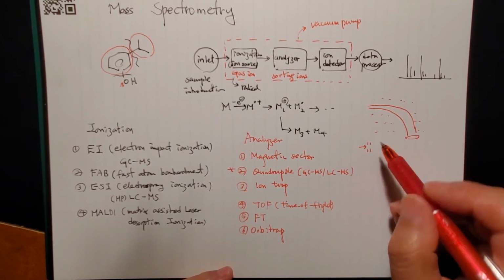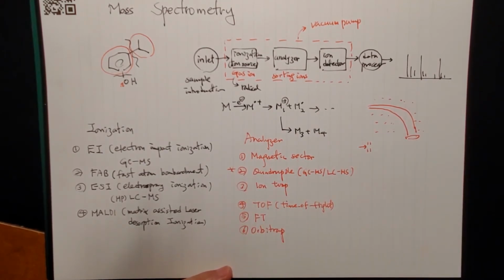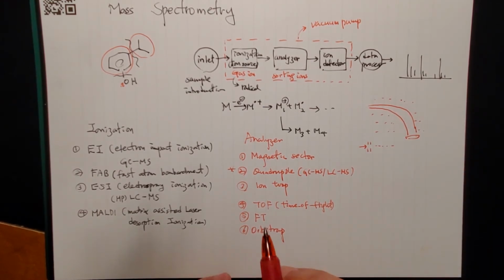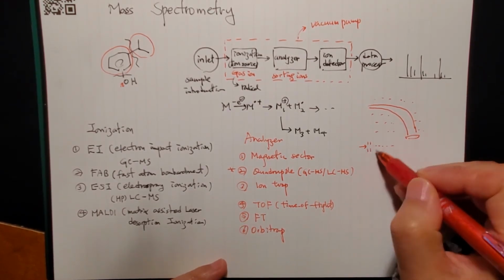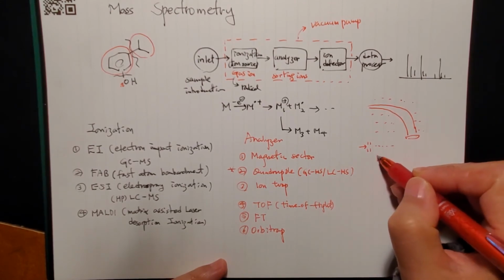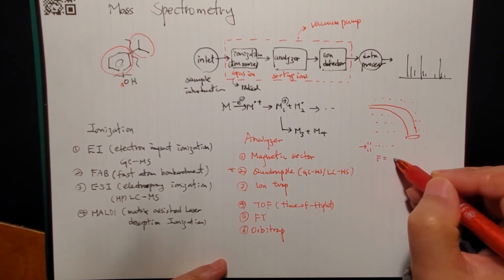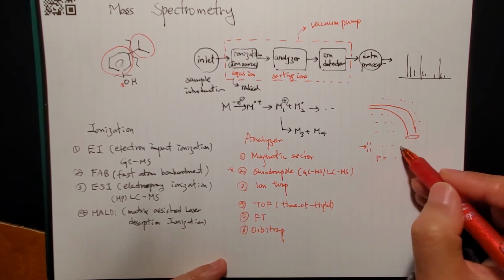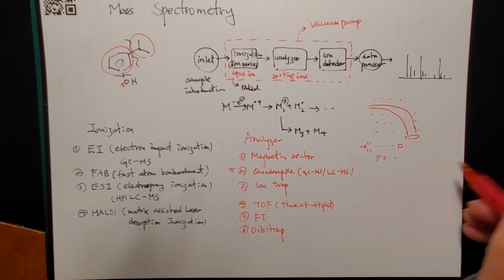That makes the ions pushed, and then the ions start to drift. But the same amount of force is given to them, so F is given, and the distance from the ion source to the detector is fixed, right?